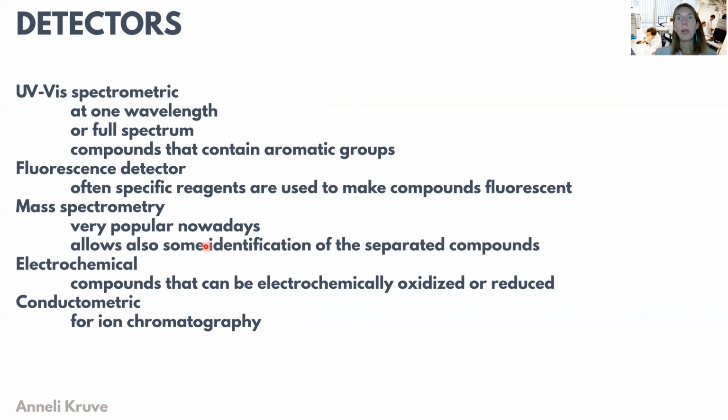So this was shortly about the instrumentation that is used in HPLC. And next we are going to look into the different types of chromatography in HPLC.